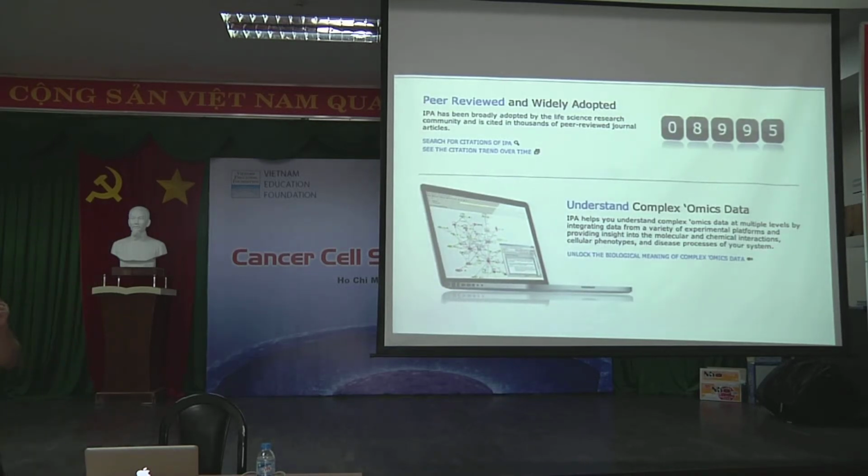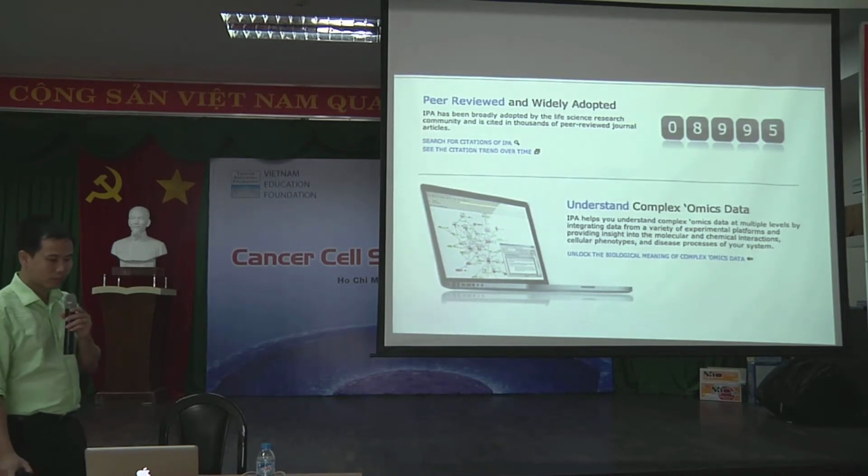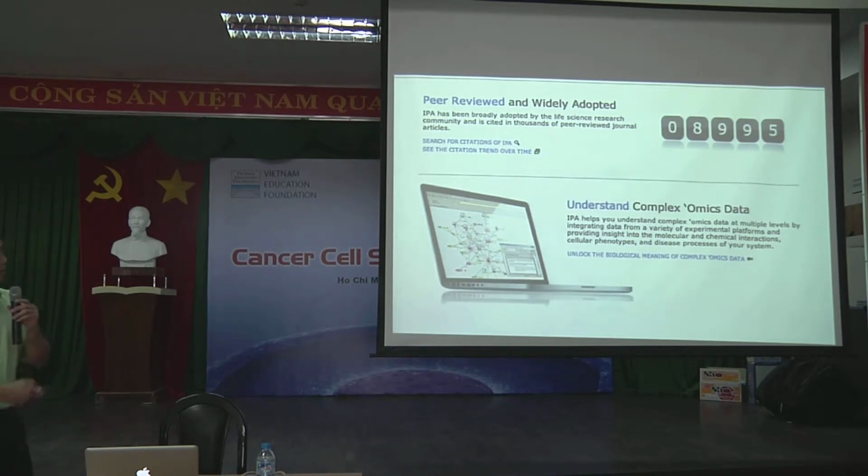IPA is a pretty young company, but it has been widely adopted in the scientific community, especially in the US and Europe. The number of papers that have used IPA in their research is almost 9,000.